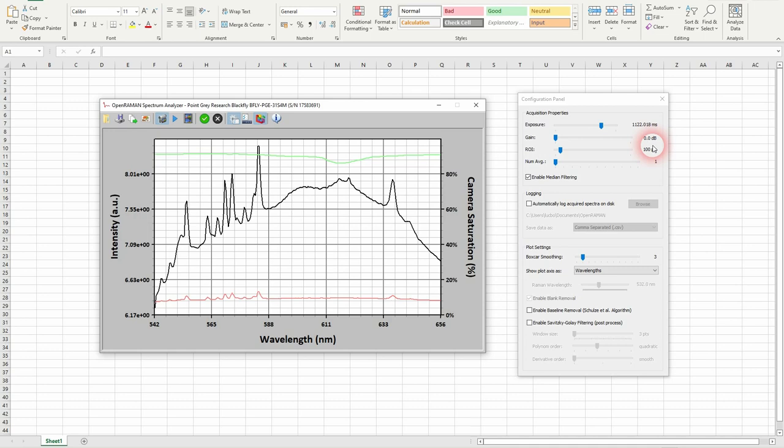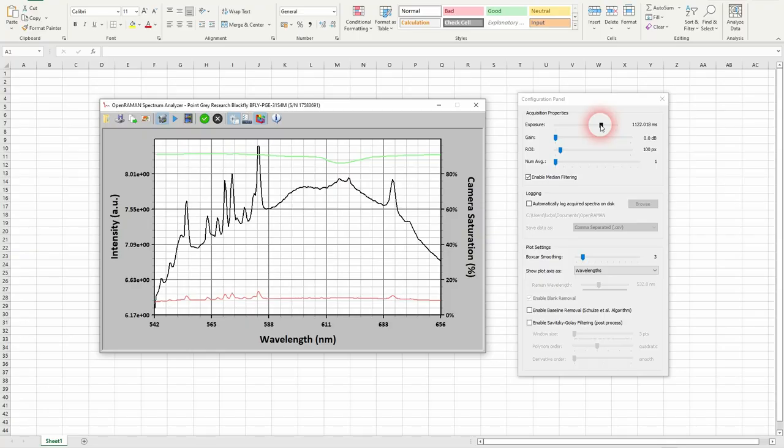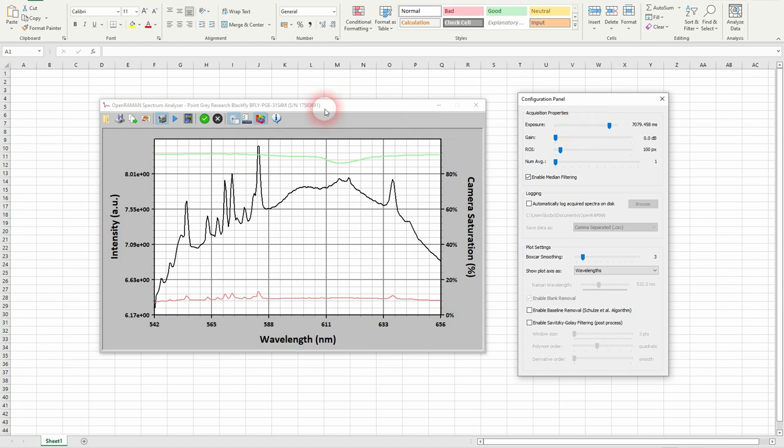If I want to reach about 80 percent, I guess I have to multiply by seven. So we'll increase to seven seconds.